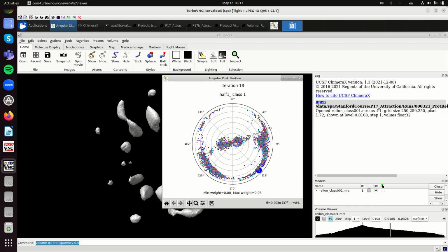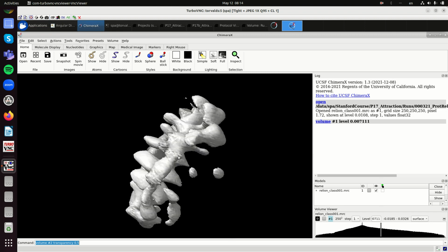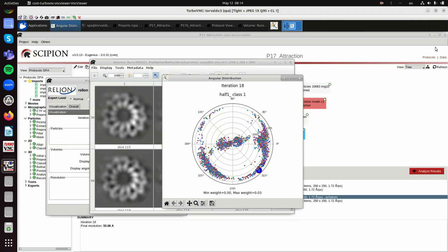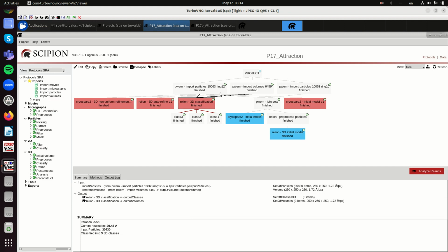So once a direction starts getting signal-to-noise ratio because the background is becoming smoother, then more and more particles will like that direction. And so here we see it in 3D. In 3D, what we see is this asymmetry, that everything is along one direction, and we see these elongations. So this makes sense from the point of view of the goal function optimization. And let's see another manifestation of this problem.